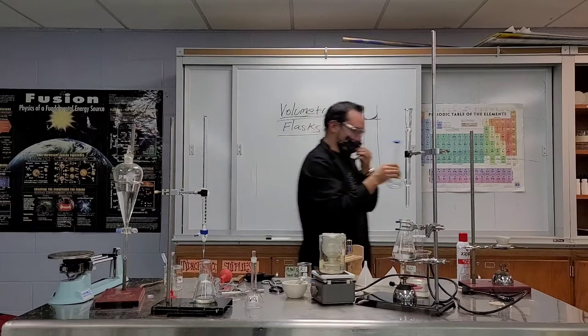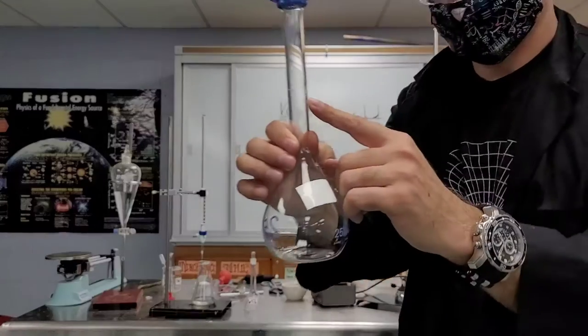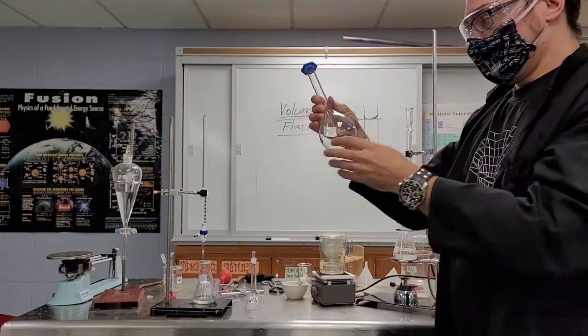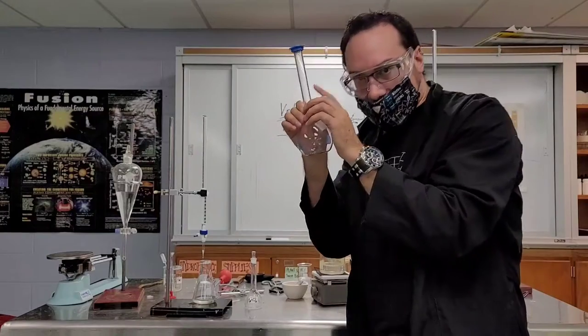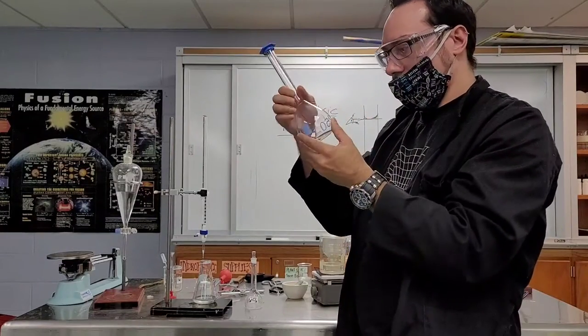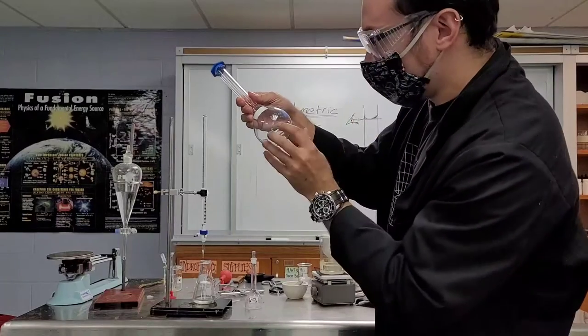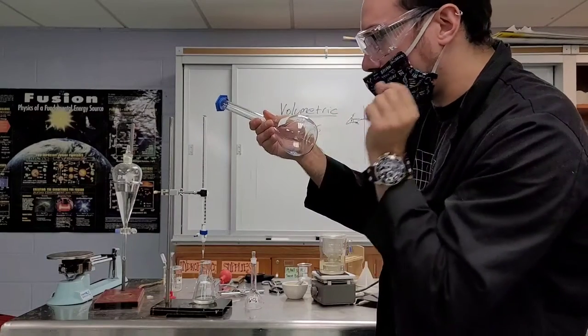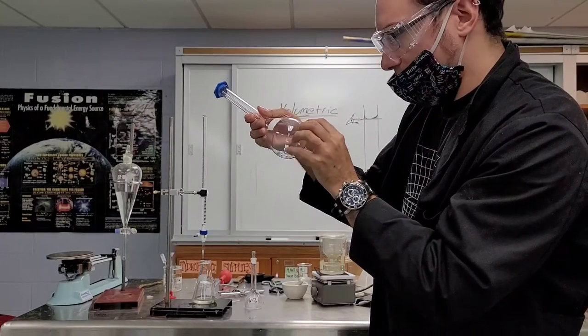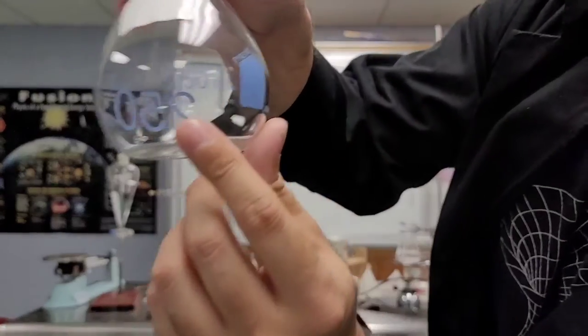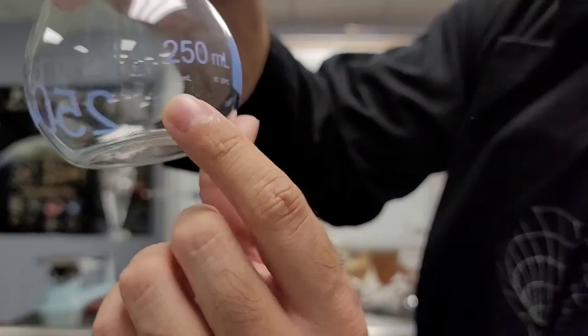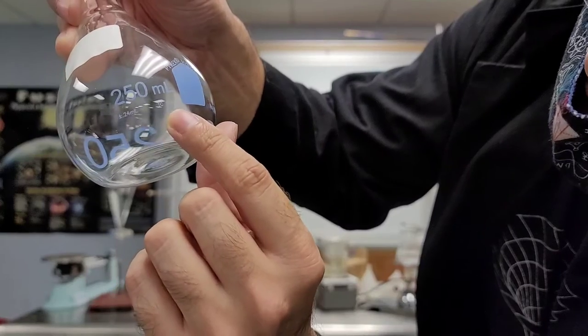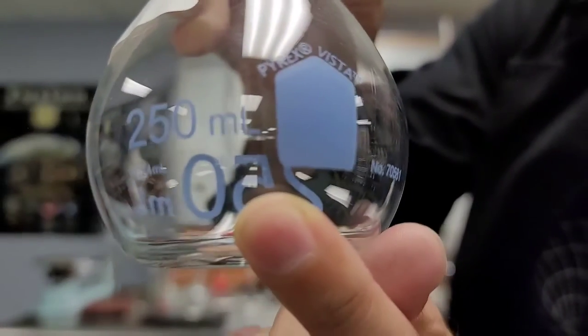These only have one marking on them. There's only one line. These are pretty expensive, made to measure exactly a very accurate amount of volume of a liquid. This says 250 milliliters plus or minus, meaning the error is only 0.24 milliliters at room temperature, at 20 degrees Celsius.